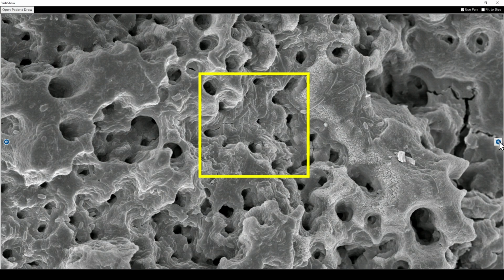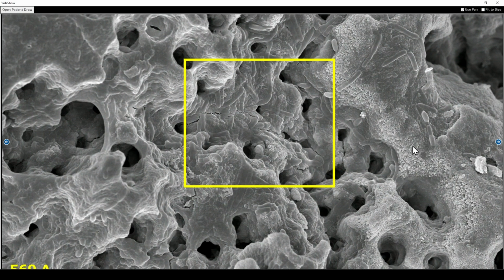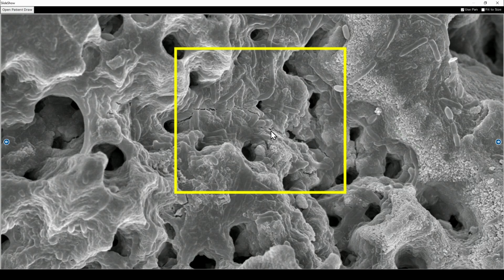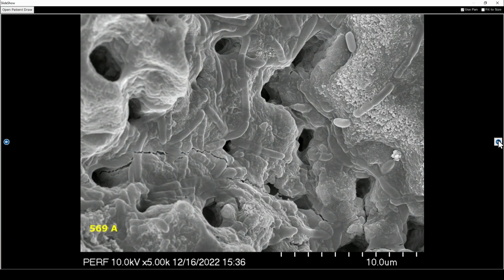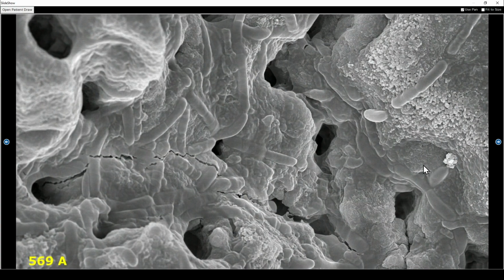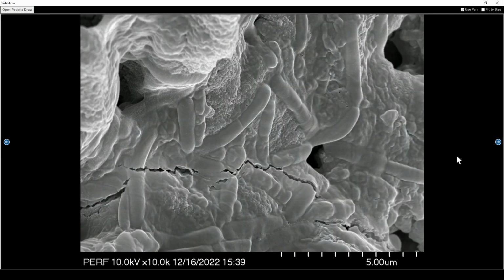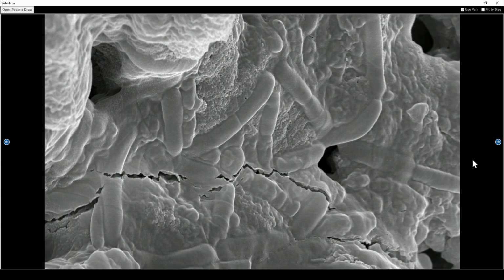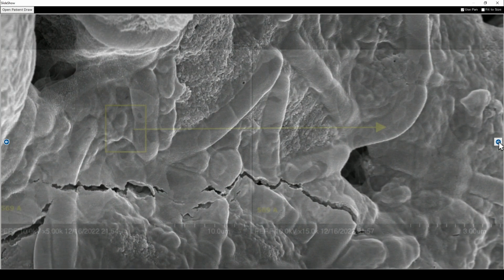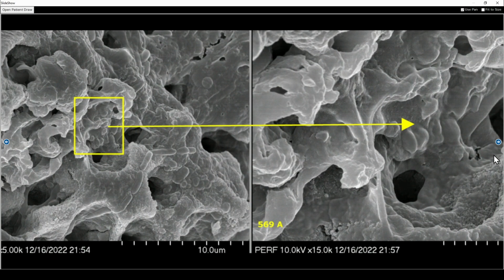So I ask you to look at these images carefully. Here you can see some planktonic bacteria on the surface of the dentin. But most of the bacteria is in this EPS, and what you're looking for in your signature is some kind of form that indicates there are bacteria within the EPS. And here you can make out the bacterial morphotypes embedded in EPS. And without that signature, it's very difficult to actually tell that there's any bacteria in this canal at all.